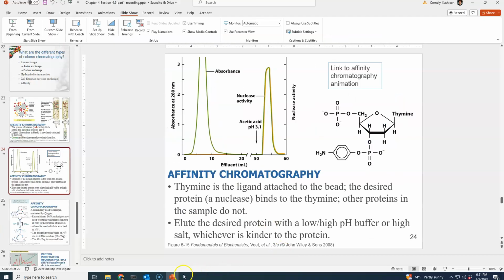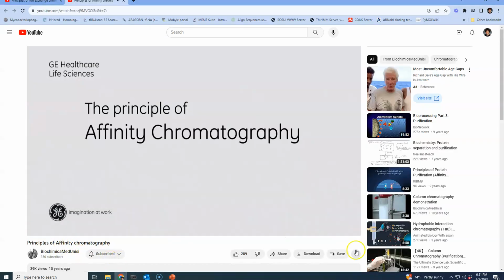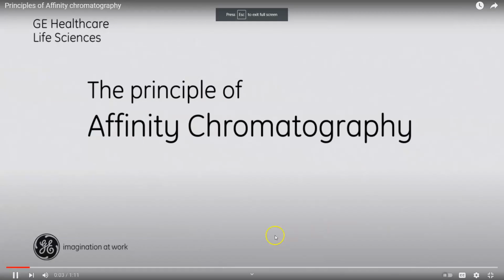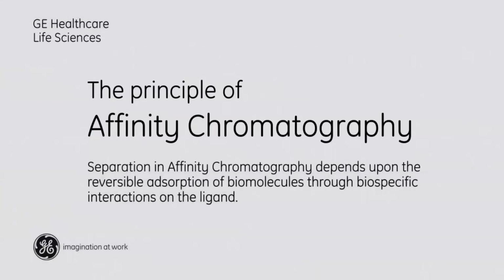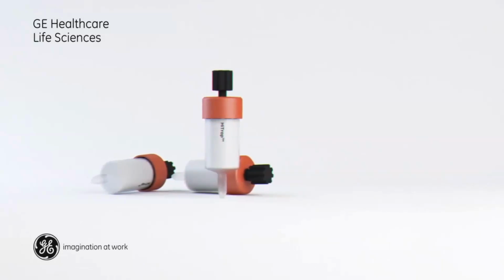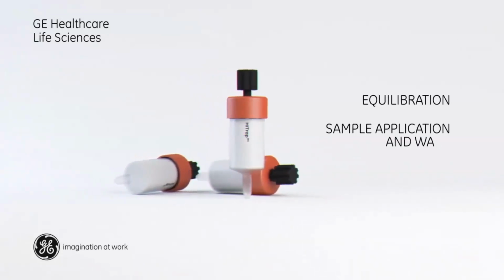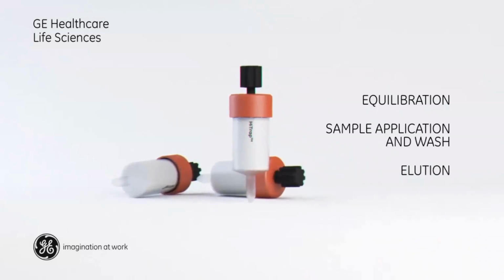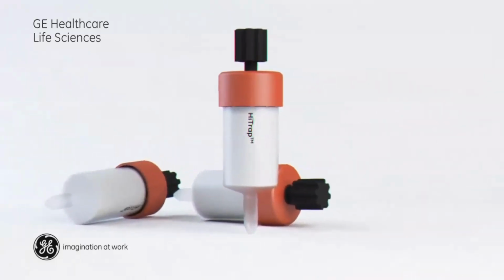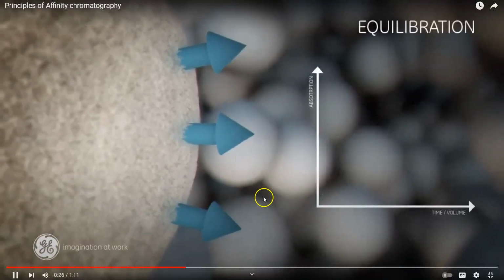So let's go back to the videos that I have queued up, and let's look at another video on affinity chromatography. Chromatography depends upon the reversible adsorption of biomolecules through biospecific interactions on the ligand. Most affinity chromatography experiments are performed in three main stages: equilibration, sample application and wash, and elution. The first step is the equilibration of the stationary phase. So here the ligands are these rocket shapes.